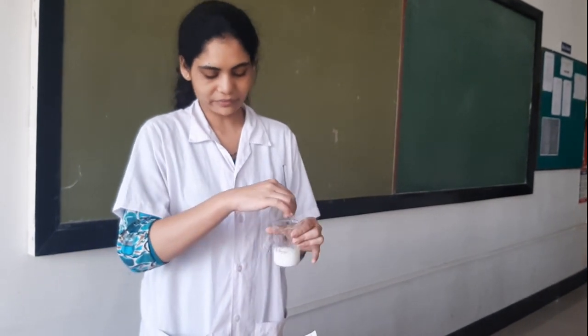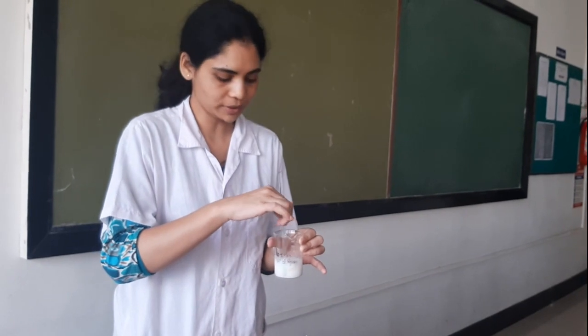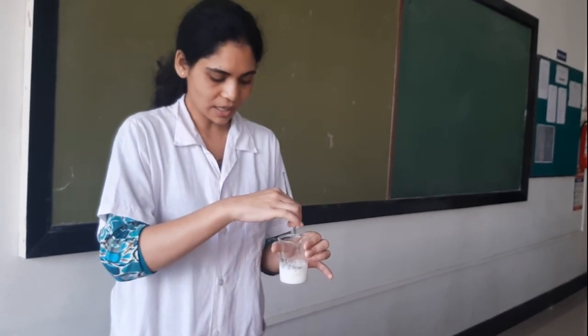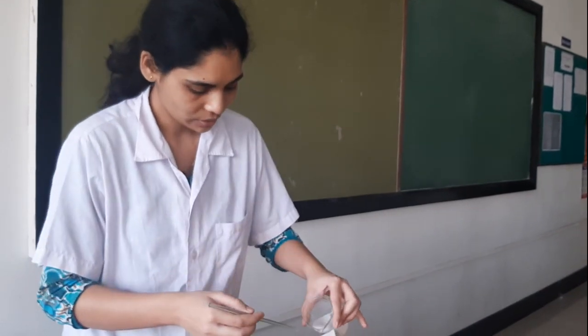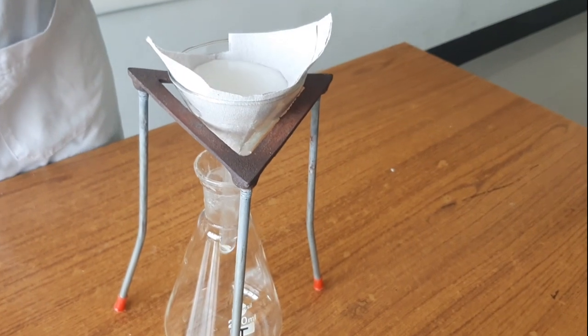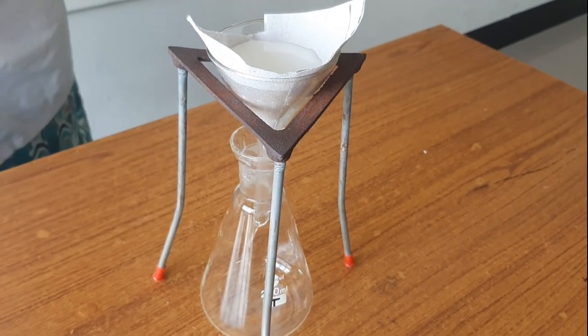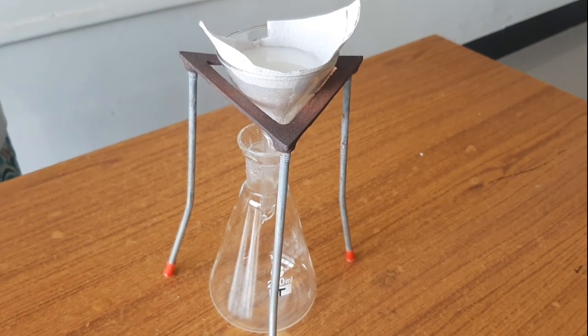First we have taken the 10% volume by volume solution of glycerine and water. That slurry we will now start to pour into the filter medium, and we will check what time is required for complete filtration. We have started the time, and we will wait until complete filtration occurs.